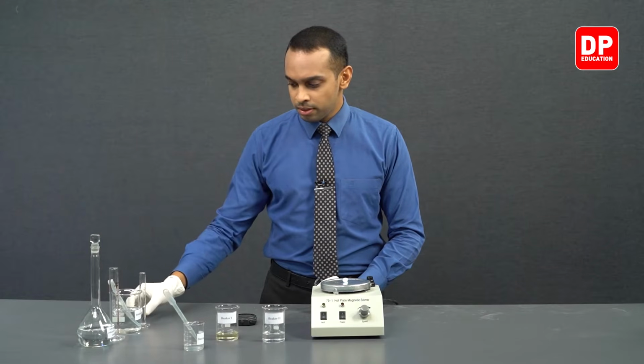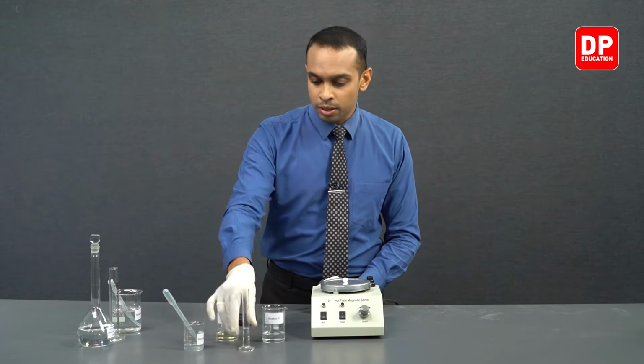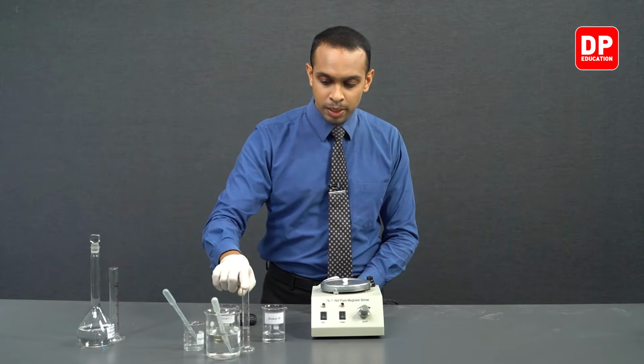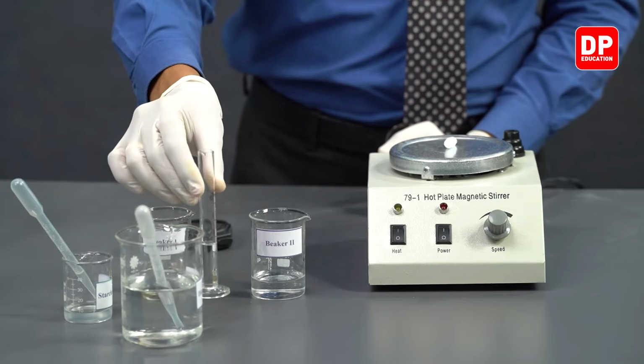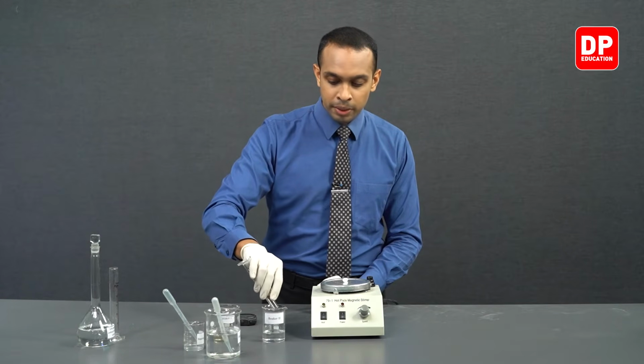And then, like I mentioned earlier, we need to add distilled water as well. So we have measured 5 milliliters of distilled water into this measuring cylinder, as you can see, and we are going to add that also into our beaker 2.